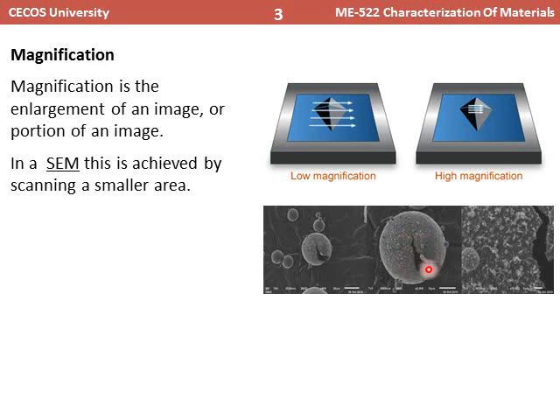So what you get at the end is this image. Basically this image is from a small portion of the very first image taken by scanning electron microscopy. So in magnification, your beam is focused on a very small area just to view what the surface looks like.